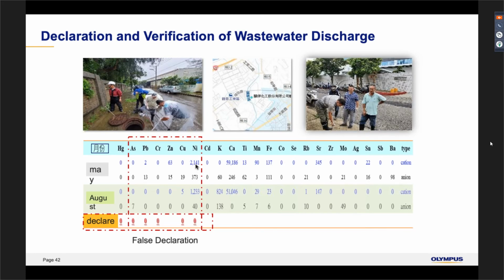What are the techniques to rectify the interference during sample analysis? There's no matrix effect because the ion exchange resin is very homogeneous, and it's an industrial product. So it's not like soil or rock. So we get very good results. Okay, so thank you, Prof.